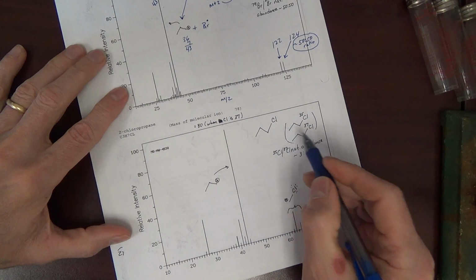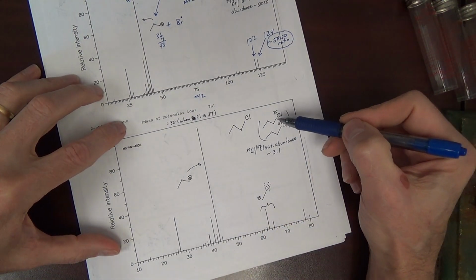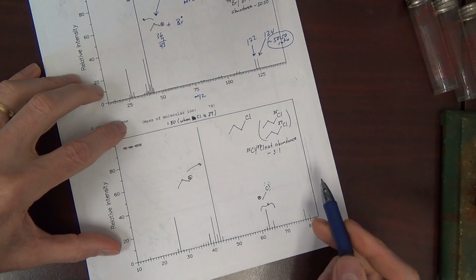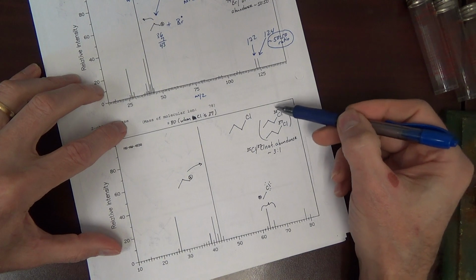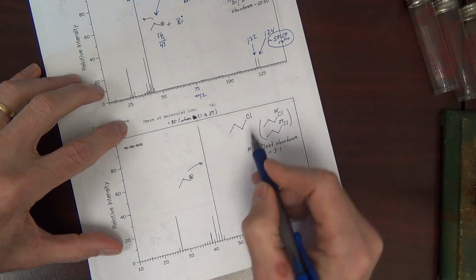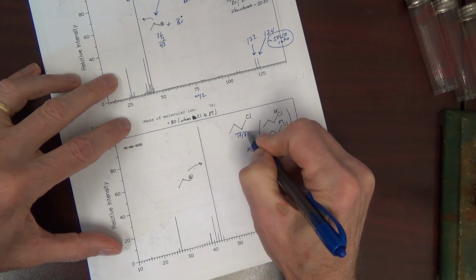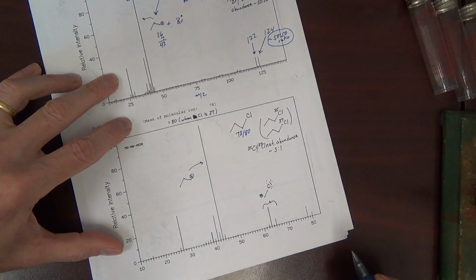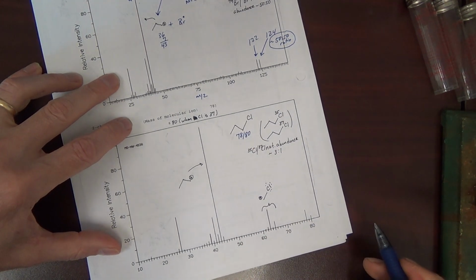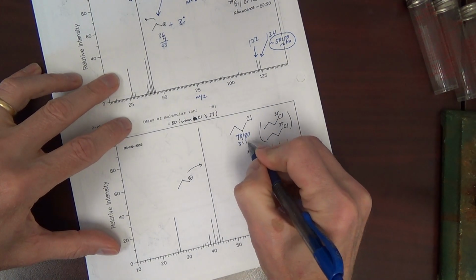Down here we have chlorine. Chlorine has 2 major isotopes, 35 and 37. Their natural abundance, though, is 3 to 1, with the 35 being the major isotope. So this molecule, if you add it up, it's going to be 78/80. Again, we see individual molecules. The ratio of these will be 3 to 1.